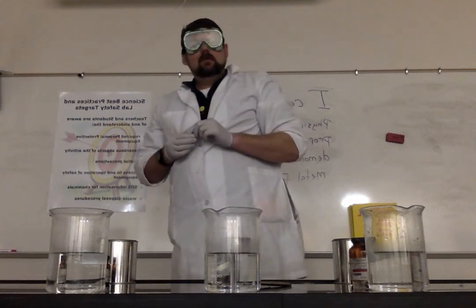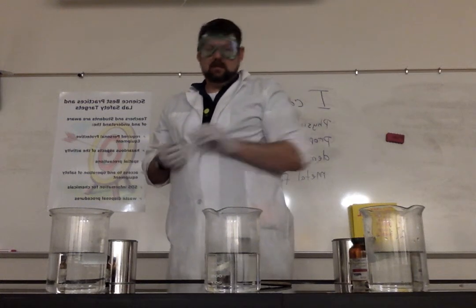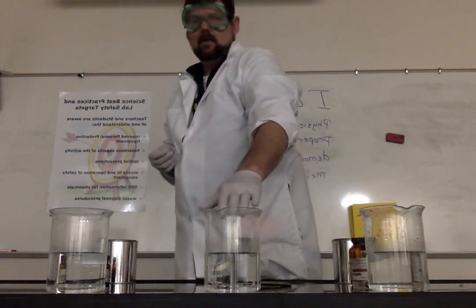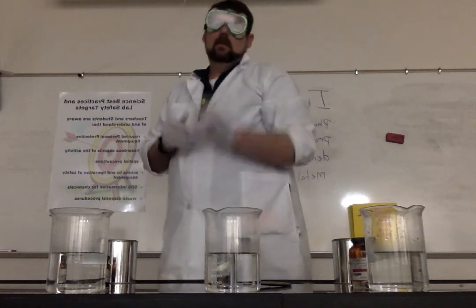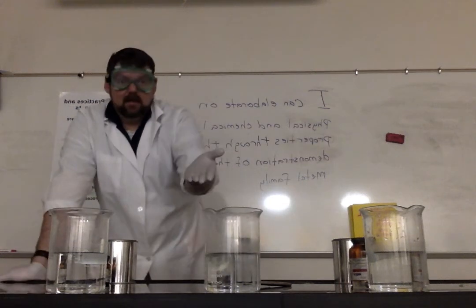Sodium has a few more electrons, so sometimes we can get a bit of a flame, sometimes it doesn't. It just does a really cool dance. Notice, large container, only half full. That helps contain any kind of flame or anything else like that, so it doesn't get out everywhere else. So let's see what happens. As soon as I put it in the water, we have a reaction. We have a lot of gas coming out.